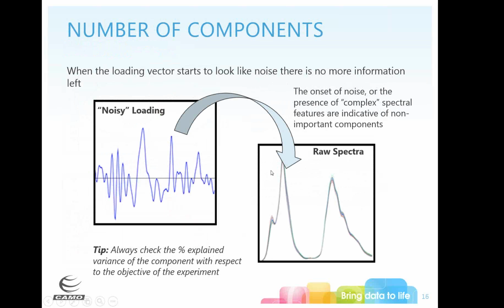Again, take a look at your components. When it starts to look noisy, there's probably no more information there, so move on.